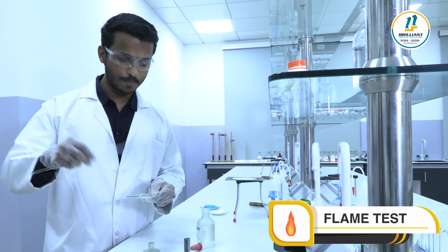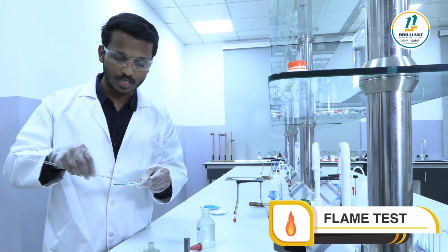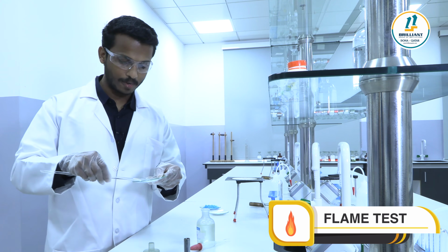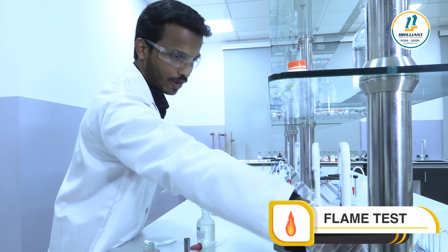Now we can rub this, mixing the given salt and the concentrated HCl very well, and make it into a paste. Then let me put it on the flame.